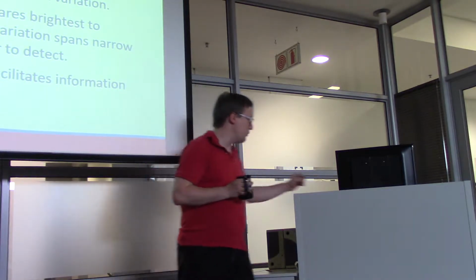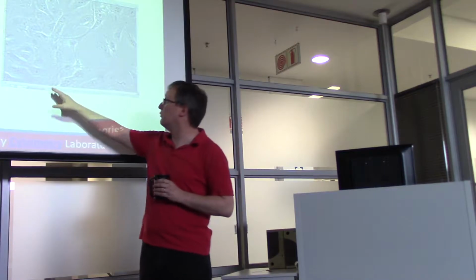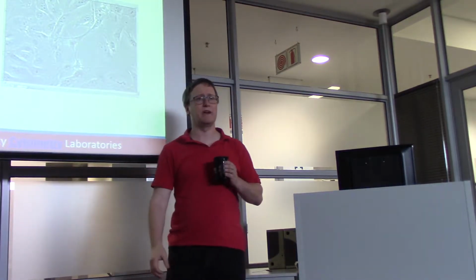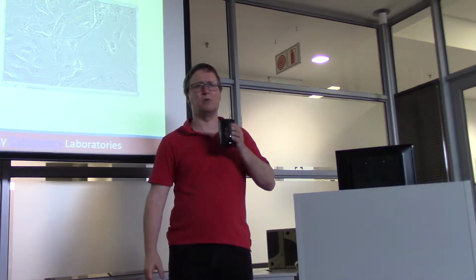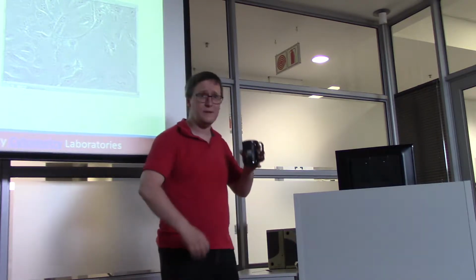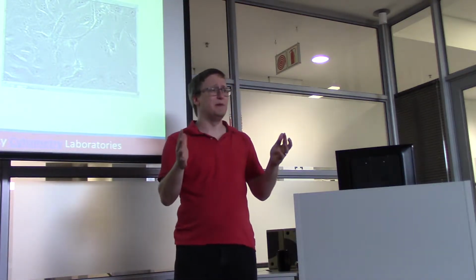And I'm going to try to walk you through a quick example of that. So let us imagine that we have captured this image on our microscope. We've all seen something like that, right? We took a microscopy class somewhere along the way. I'm not a good microscopist. But imagine I have produced this image. Now, can I get my data out of it?